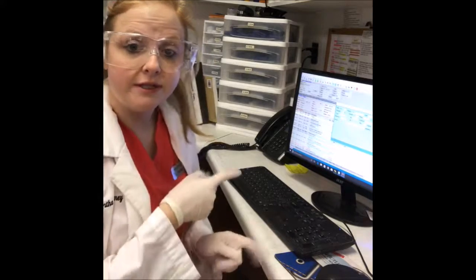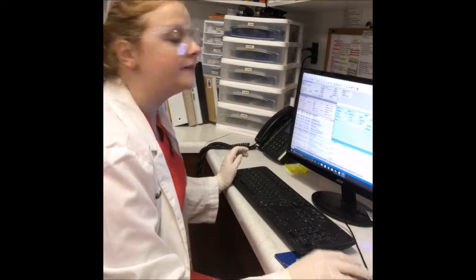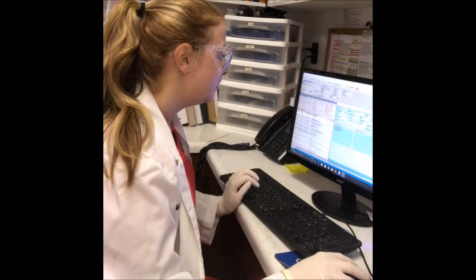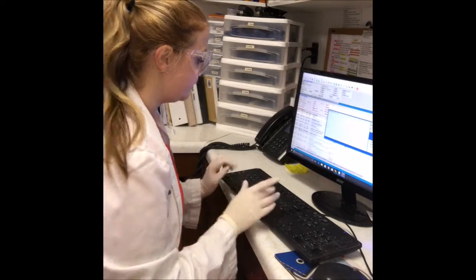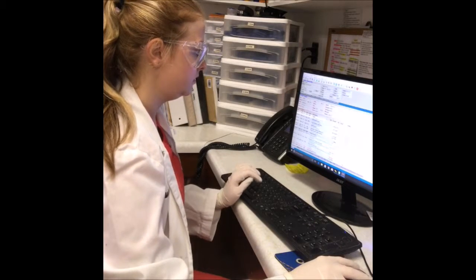Okay, so now that we have read the direct fecal smear, we're just going to record the results in the computer. So I'm under the animal. We're using Avimark here. We have a fecal direct smear. I'm going to timestamp it with my initials and put the smear was negative. So now that we have that in the computer, when we go back and look at it, we can see what we've done and we can see what the result was.